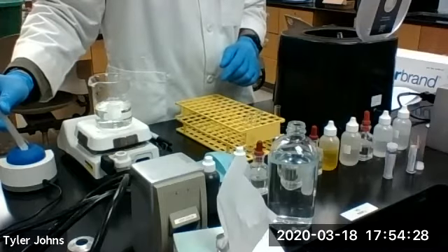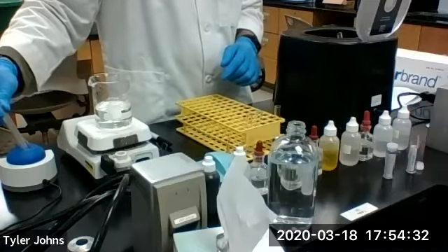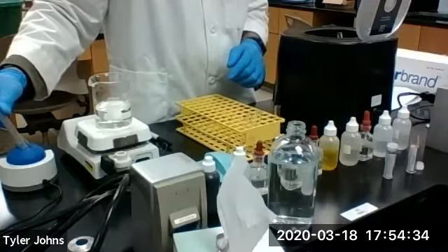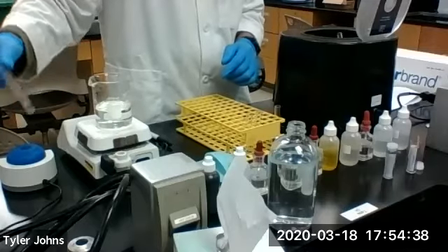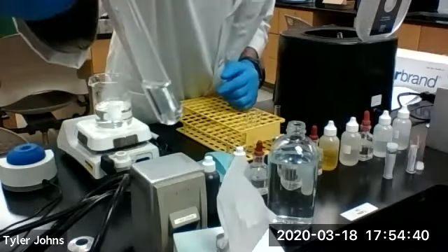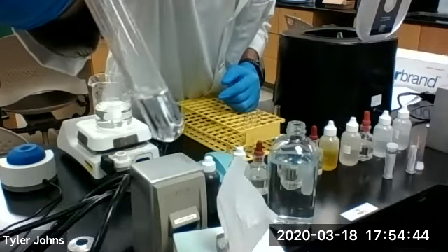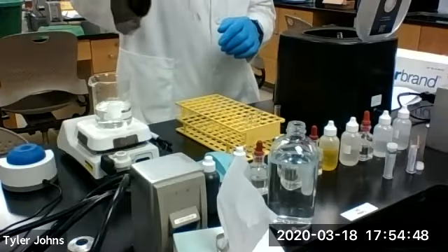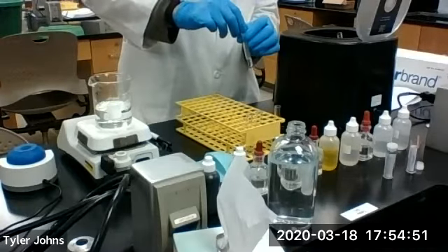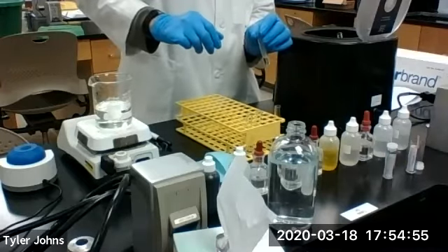This will dissolve our magnesium precipitate. As you can see, the magnesium precipitate has dissolved. Now to our solution, we're going to make it alkaline with 6 molar.